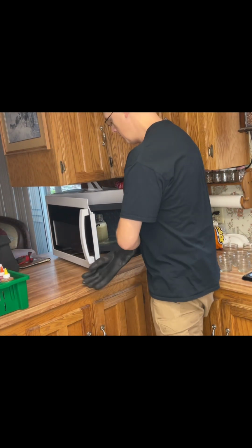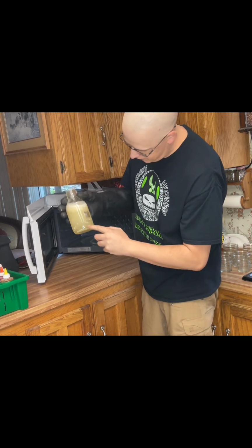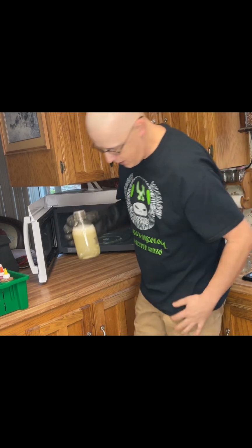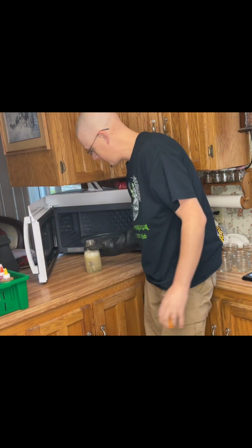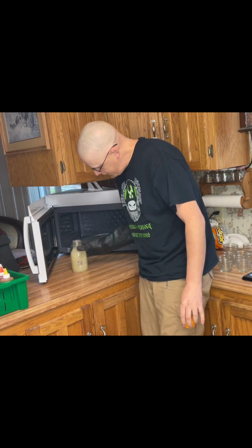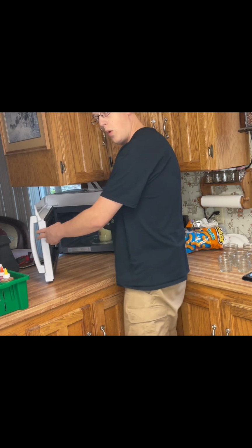Alright, so we got some foaming action here on the Gellan gum. You can see there's kind of a clear layer at the bottom here. It's kind of bubbly and foamy at the top. That means we're getting there. It's starting to melt in pretty good. I'm going to go ahead and give it one more mix here, and we're going to watch it real close because it's going to want to bubble over.